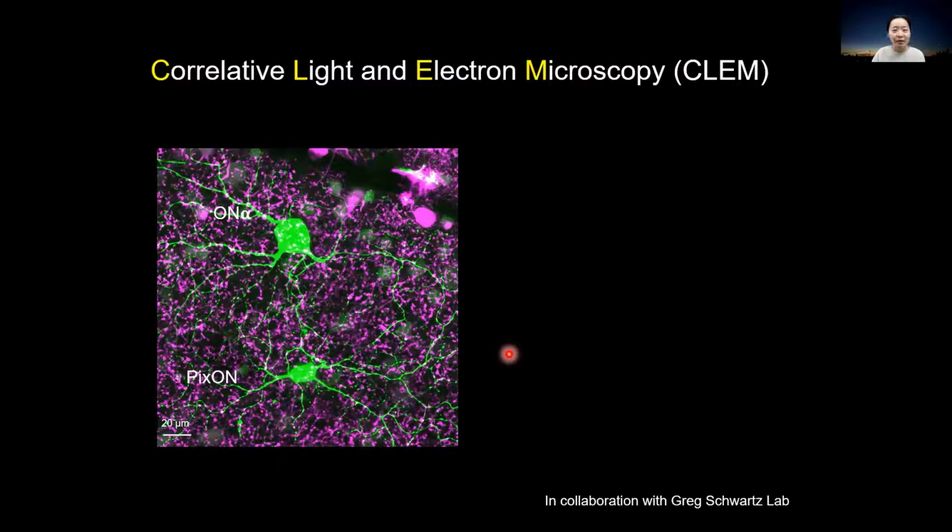We combined SEM with light microscopy largely because using LM, you can pre-identify and target cells of known structure and function for reconstruction. For example, in this image, two adjacent retinal ganglion cells with overlapping dendritic arbors were intracellularly diffused with Alexa 488, which is shown in green here, in a transgenic mouse line in which one type of the presynaptic bipolar cells express the red fluorescent protein tdTomato. The light responses of these two ganglion cells were also recorded.